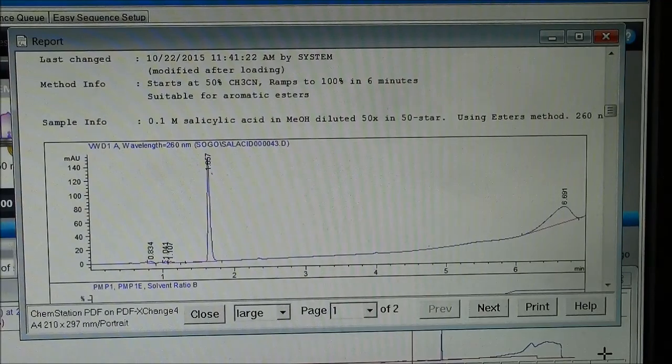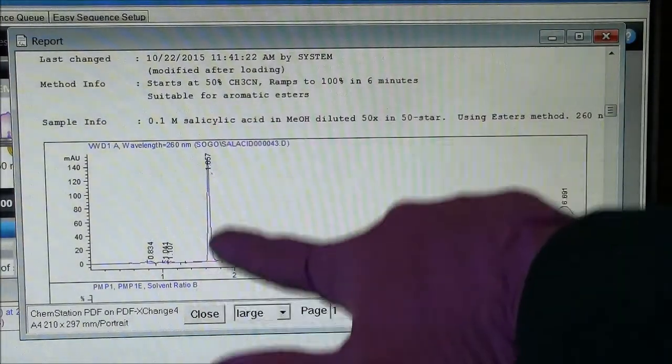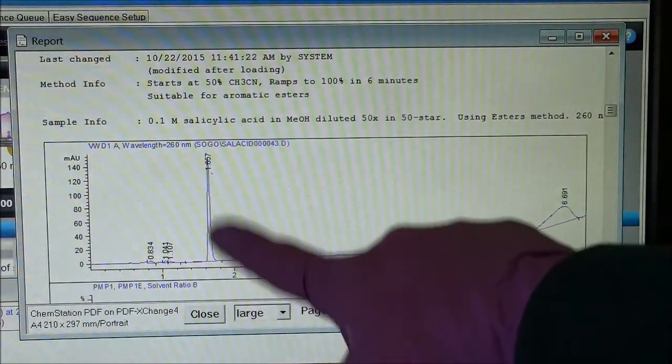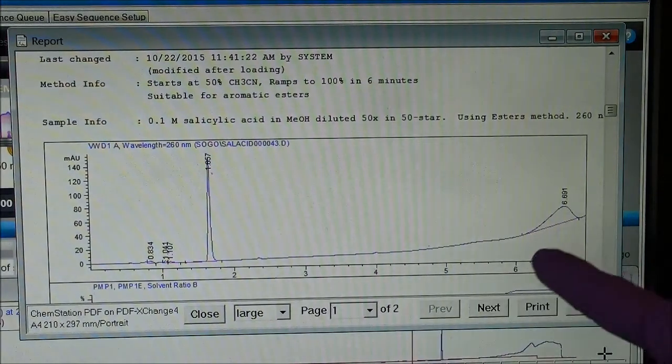When the run is complete, this report will appear. You can see there's my beautiful sharp peak. I'm almost certain that's salicylic acid.